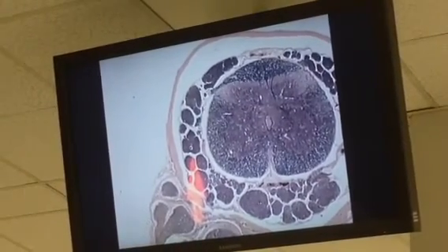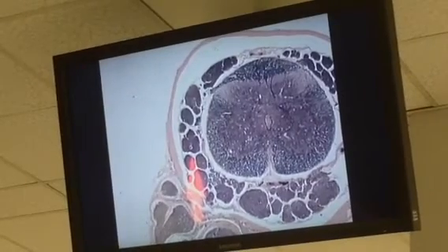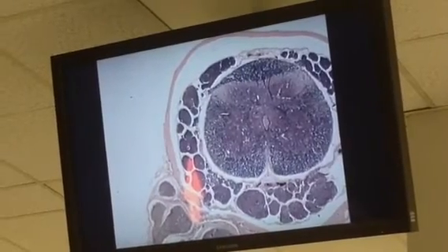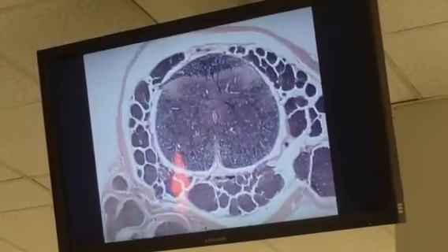Remember, the spinal nerves have to exit where? In an intervertebral foramen. Familiar with that concept? Okay. Between two vertebrae, that's where the space is. They can go out. And so they have to go down. So these are pieces of the cauda equina that you're seeing.